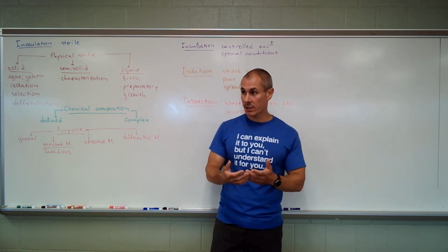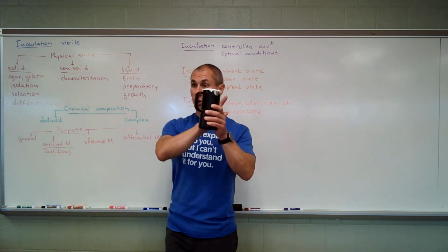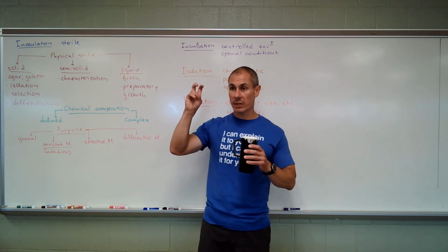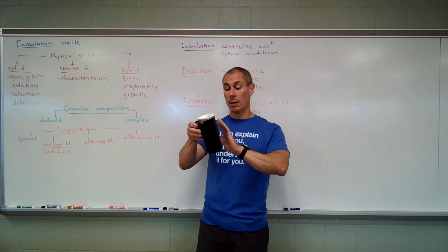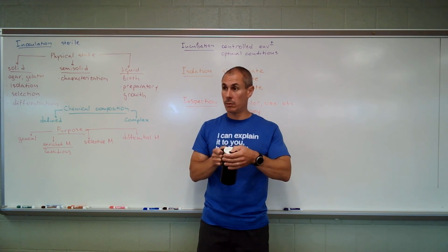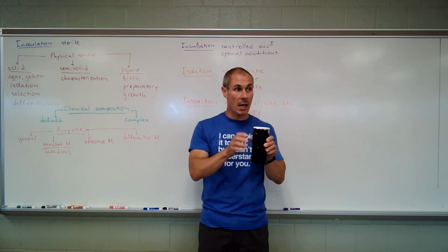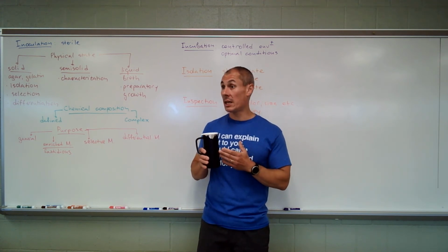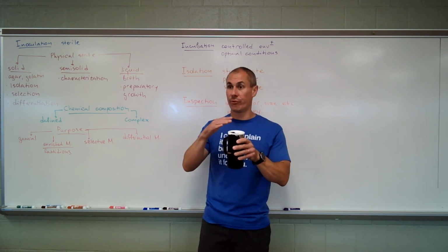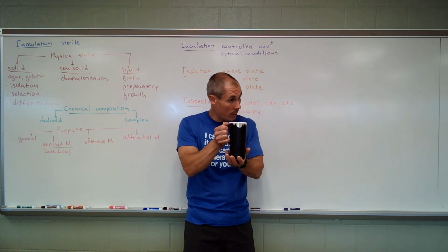Scanning microscopy. What do you use it for? To appreciate the surface and the shape. So imagine that you look at this mug using scanning microscopy and you say, okay, kind of smooth, there's a little thingy here, the sliding closing thing on the lid, there's a handle, I can appreciate that. What's inside? I have no idea. Maybe it's rock solid inside, maybe it's all filled with molten gold or something, I have no idea, right? So you appreciate the shape.